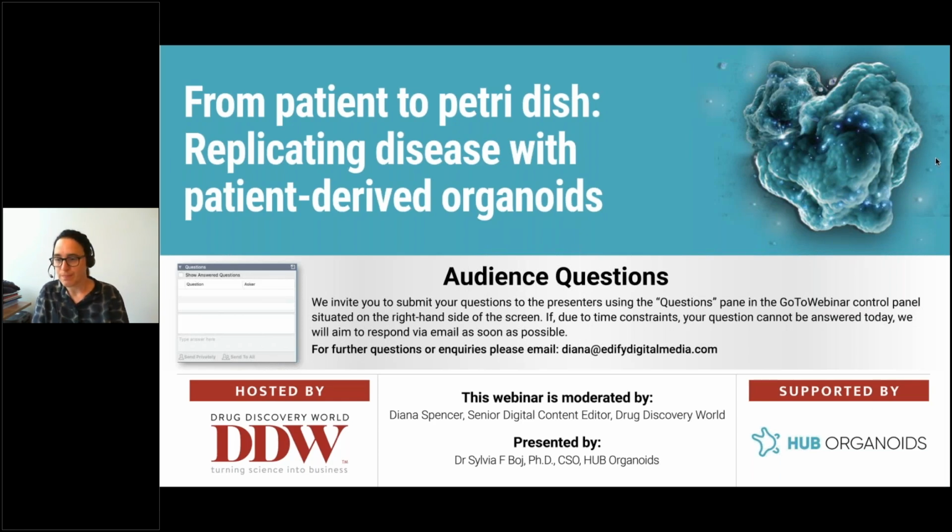Thank you. The next question relates to intestinal tissues. It says, is it feasible to generate PDOs from severely inflamed intestinal tissues, as this is a known cause of stem cell depletion? From our collection of the IBD biobank, we were able to establish models from regions that the radiologists identify as inflamed regions. Of course, it's very important that the biopsy collects part of the crypt where, even if they are depleted, there are still some stem cells.